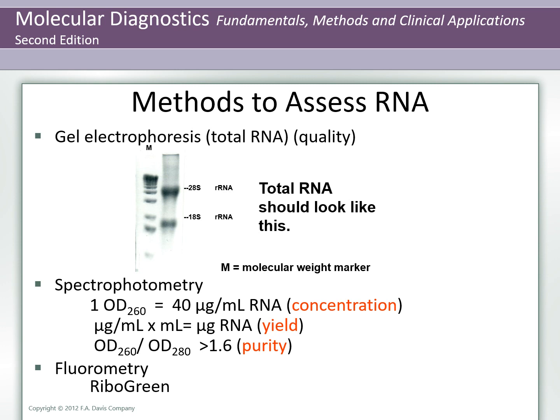One other method to assess RNA is fluorometry, or fluorescence spectroscopy. It measures fluorescence related to concentration and can be used for DNA or RNA. SYBR Green II RNA gel stain intensity of fluorescence is 20 to 26% lower with polyadenylated RNA than with total RNA. Of note, this dye is not specific to RNA and will bind and fluoresce with double-stranded DNA as well. Contaminating DNA must be removed to get an accurate RNA concentration when using this method to assess it.